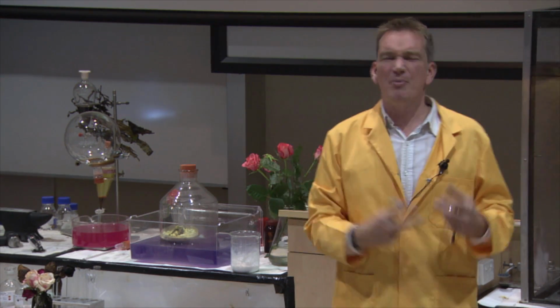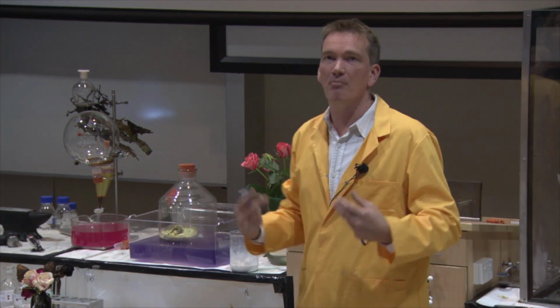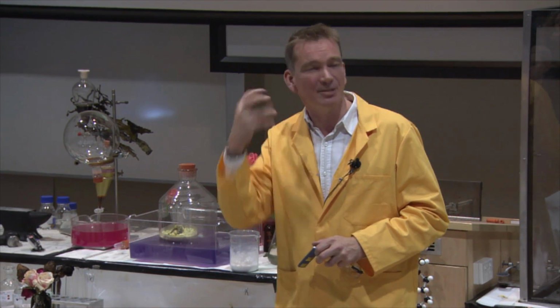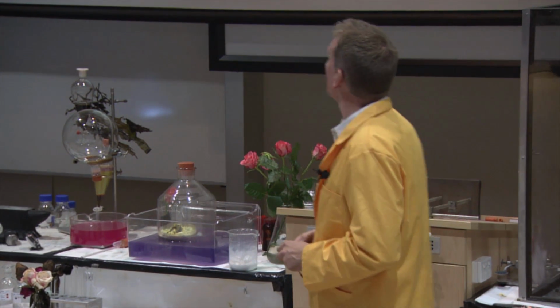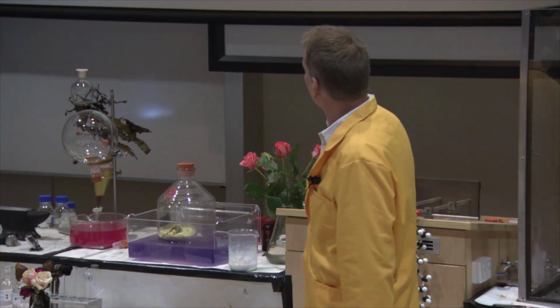Okay, well, I thought it'd be nice to try and do this, see if I could make some ammonia to show you from some horn. The horn of the hart there is actually made up of lots of hair. So I thought, well, I'll start from hair. And this is what I did. I took some horse hair, and that's what that is. It's just lots of hair from a horse, put it in a flask.